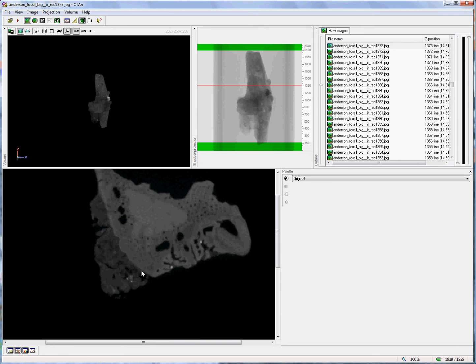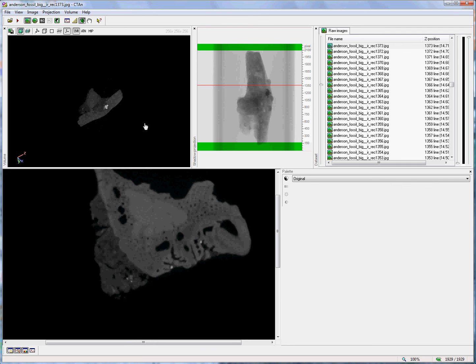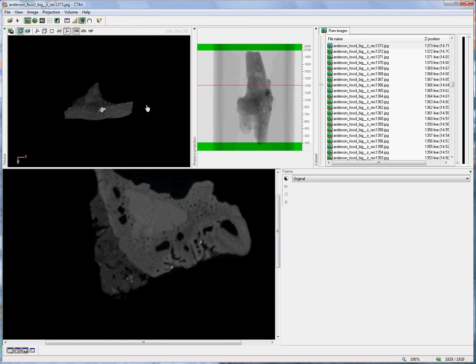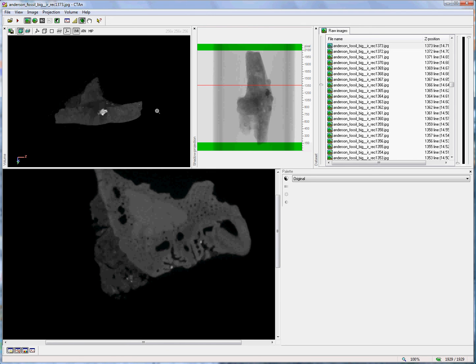When the volume rendered model appears, one can manipulate it using the right and left mouse buttons. The left mouse button implements a rotation movement, while the right mouse button, moved from left to right, moves the object closer or further away.